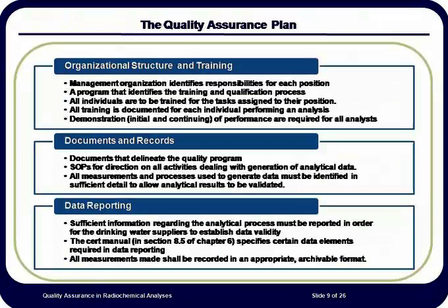As stated in this slide, the Quality Assurance Plan, or QAP, needs to specify the details of each of the areas required for laboratory operations. This plan is the framework that provides the long-term continuity and consistency of laboratory operation and ensures that there is a continuity of quality measures from sample receipt to data reporting.